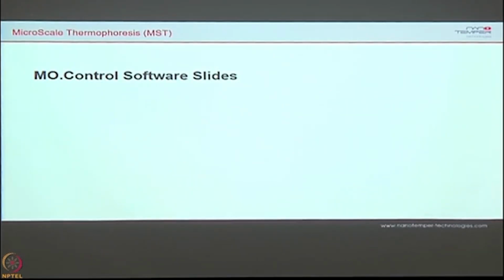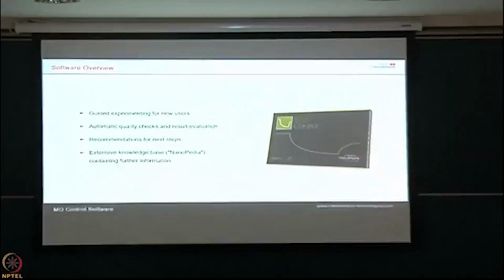So these are some examples of what I want to tell for a variety of interactions, how these techniques work so successfully. So any questions or any other things you wanted me to know, I shall be glad to address. So now, as I said, you are aware of the principle, how it works, and you know what variety of applications can be done on this. Now I'll quickly take you to the software, like how this instrument can be operated. In a nutshell, this software is artificial intelligence driven.